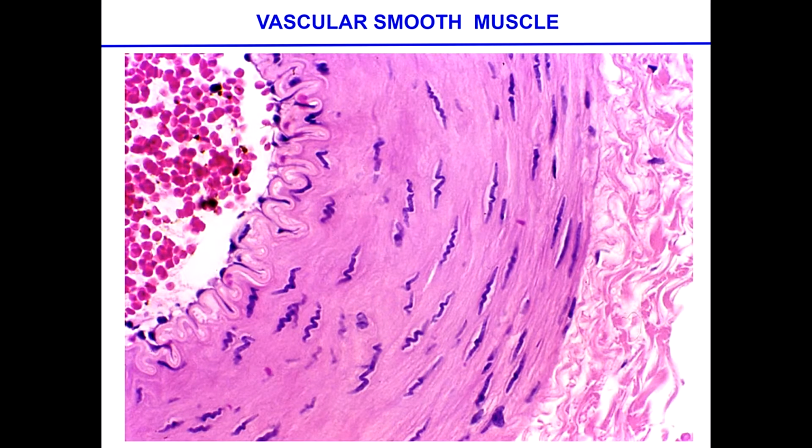This is in a blood vessel. You can see the erythrocytes right there. You can see the connective tissue out there. You can see all the smooth muscle with the elongated structures, the elongated cells. And I've been thinking about it, almost losing sleep. I don't understand why the nuclei appear the way they look.